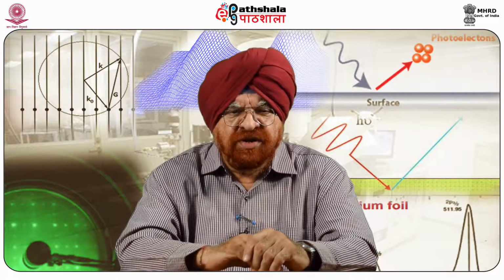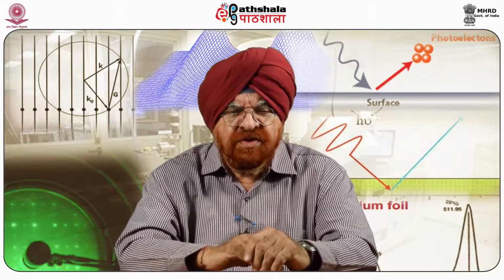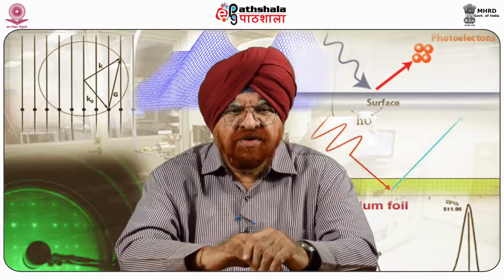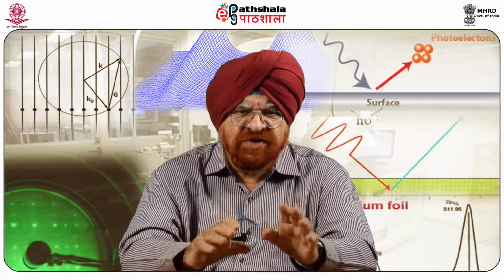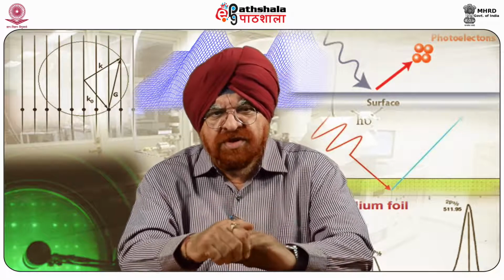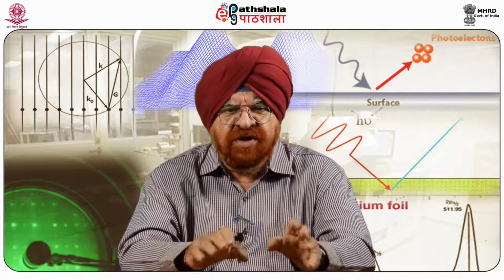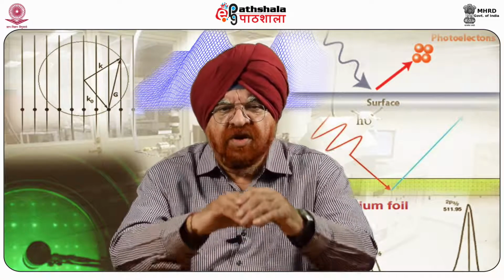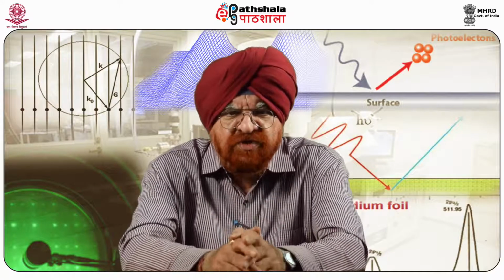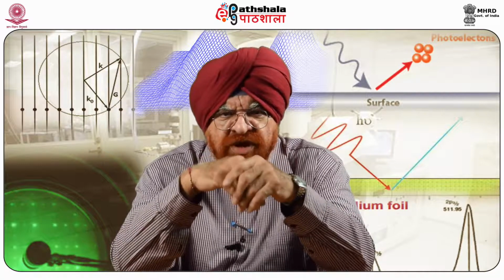Since the early 1990s, it has been widely used in the fundamental research of magnetic material as well as in the development of magnetic recording components. This detects the quantity that is of particular interest for the magnetic recording processes, namely the magnetic stray field produced by a magnetized medium or by a write head.